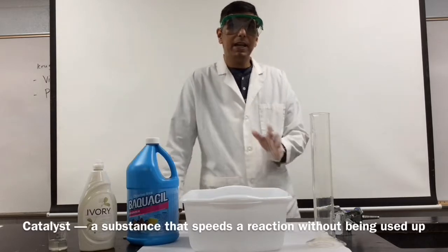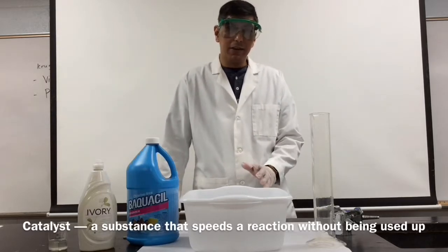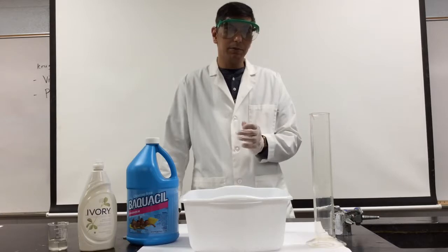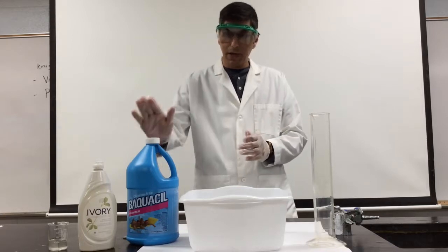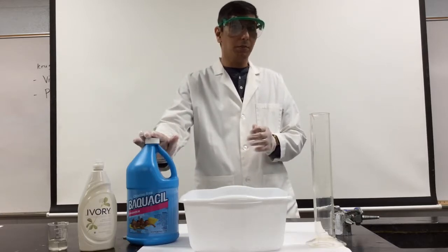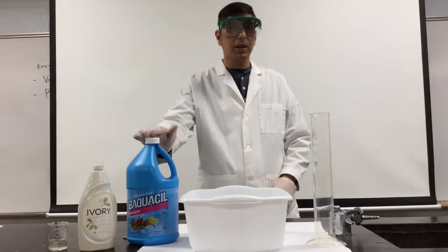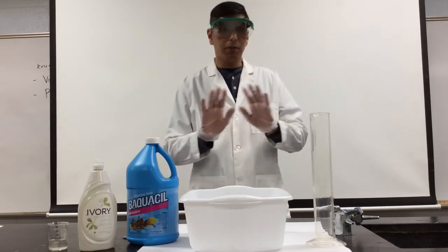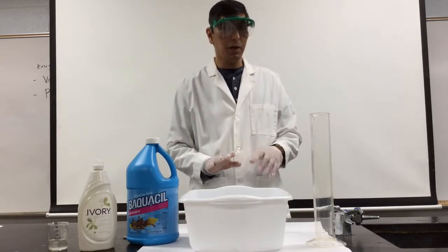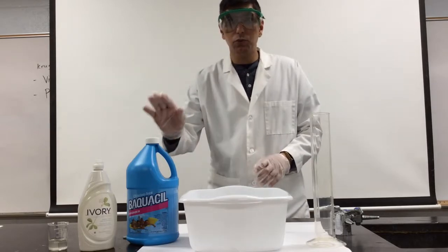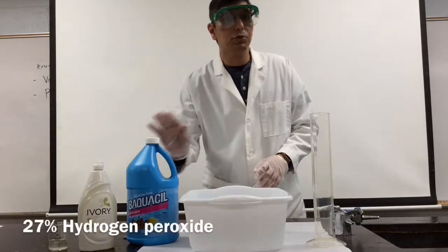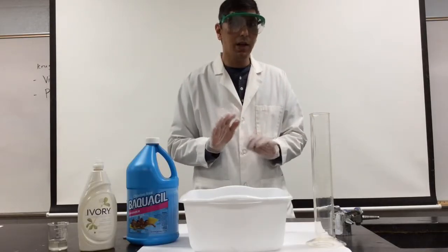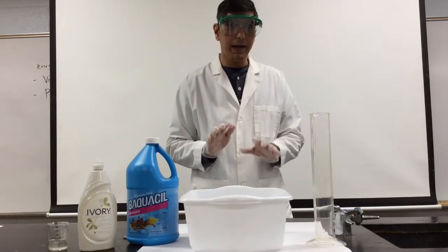This is probably the most common catalyzed reaction that most chemistry students see in class. We're going to take some hydrogen peroxide and watch it decompose into water and oxygen gas. But the hydrogen peroxide we're using today isn't that 3% stuff that you might put on a cut or a wound — this is 27% hydrogen peroxide, 9 times more concentrated than what you'd buy at the drugstore.